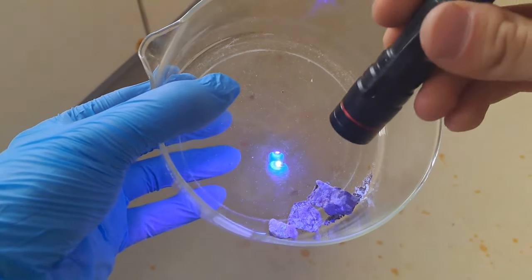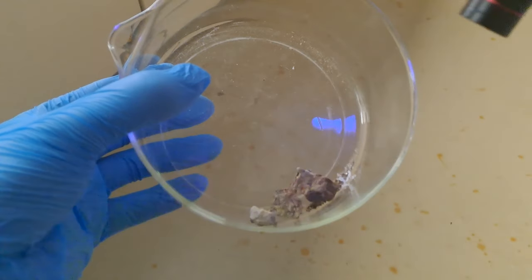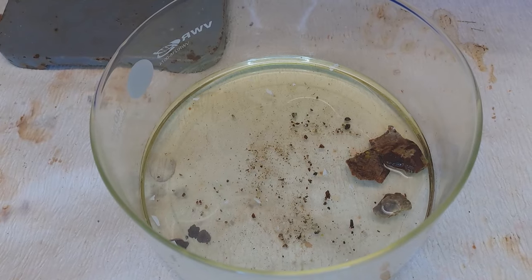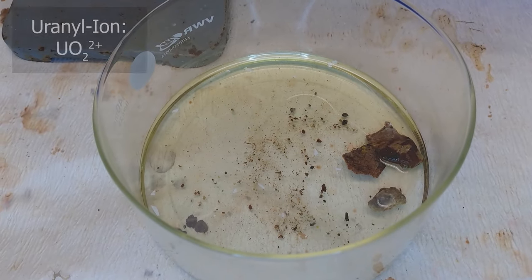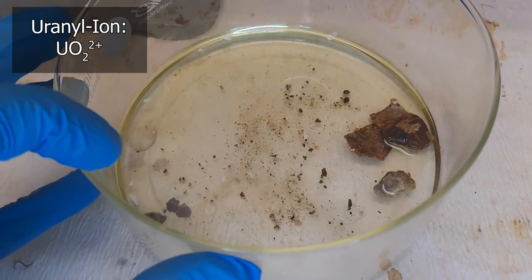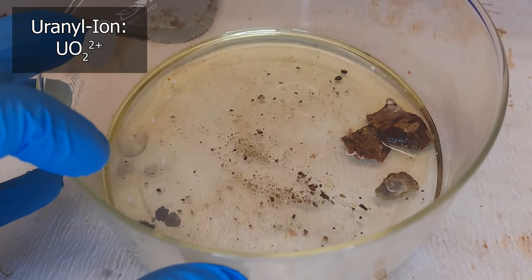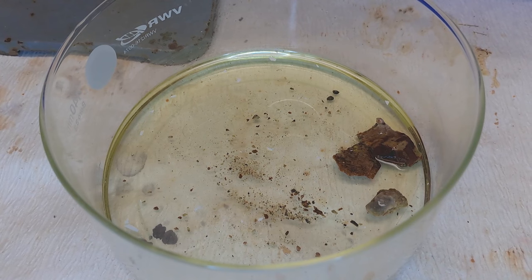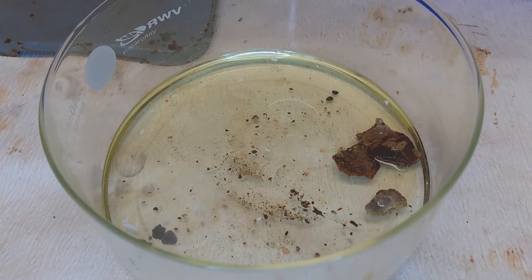Some uranium minerals have an interesting property of fluorescence, but these are not the prettiest ones, so I don't mind dissolving them. What do we use for that? Concentrated hydrochloric acid. You can immediately see the solution turning yellow. This is due to uranium in the oxidation state plus six as dissolved uranyl ions. The goal of this experiment is to extract the polonium from the mineral as simple as possible. Therefore, we don't even grind it. Just let it sit for two days in the hydrochloric acid.